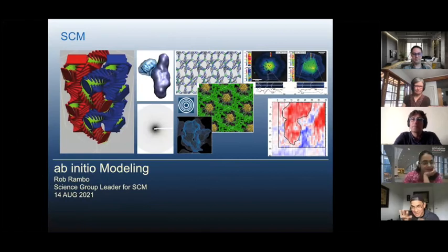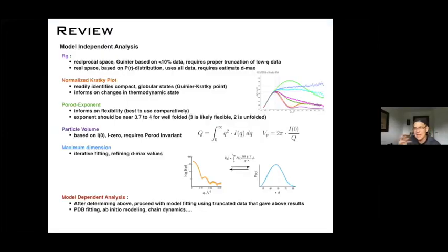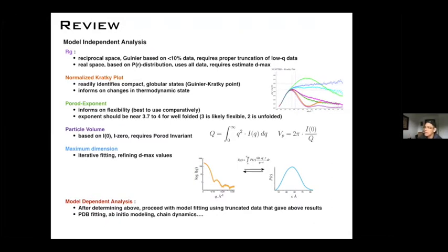So I'm just going to give you a flavor of how SAXS has been used in modeling since I started doing BioSAXS. This is a summary of a lot of work that's out there, work that I've done and others. But a brief review from yesterday: when you do SAXS, we have what we call model independent analysis.